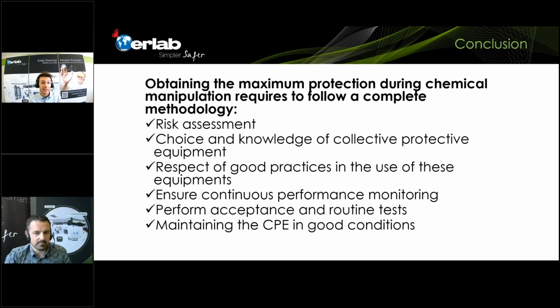However, when we talk about heating, and we talk about flames, there is often the question of, okay, how much is evaporated in the end? So how many chemicals are coming free? When you heat something and look at boiling water, of course, everything comes free. So in those cases, we are very precautious in recommending our filtration technology, because often the evaporated amount is very high, and then the filter will get saturated quicker. But it is possible. Again, we need to perform the risk assessment in order to know if it is a safe solution or not to use a ductless fume hood.